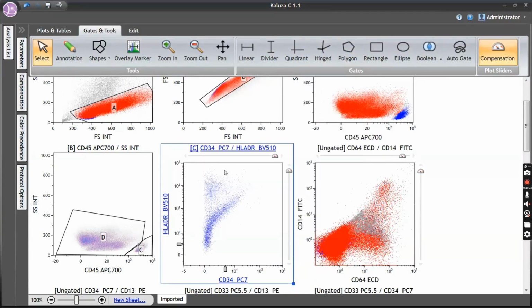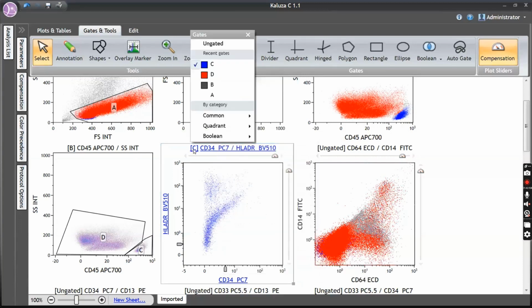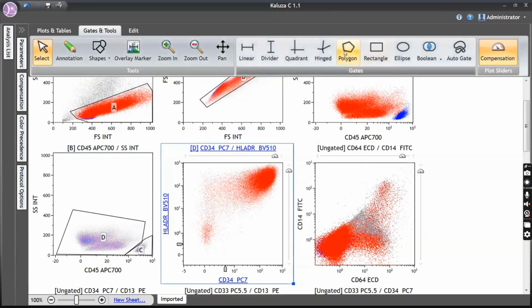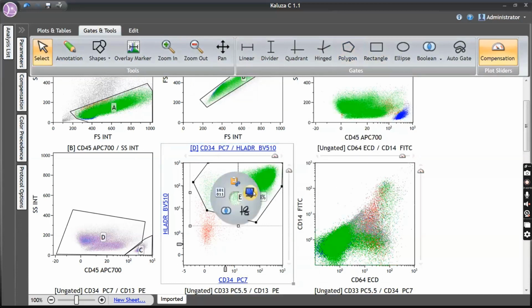Here, these are all B cells, and there are some T cells, some chunk population. It's okay. Now let me refine my blast with this population. So let me apply the CD45 dim to negative population here, and my blast would be somewhere here. Okay, it could show variable CD34, so I'm taking all these populations into consideration. So this is my blast, and its percentage is 68.9%.